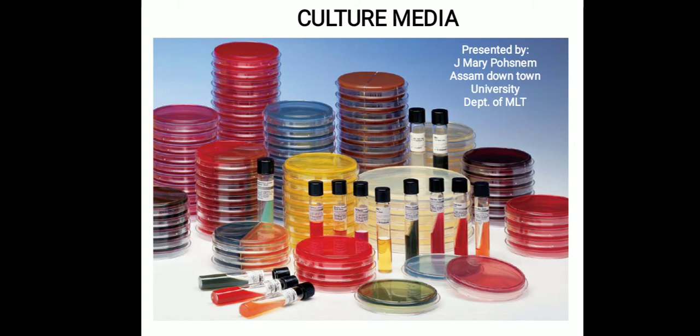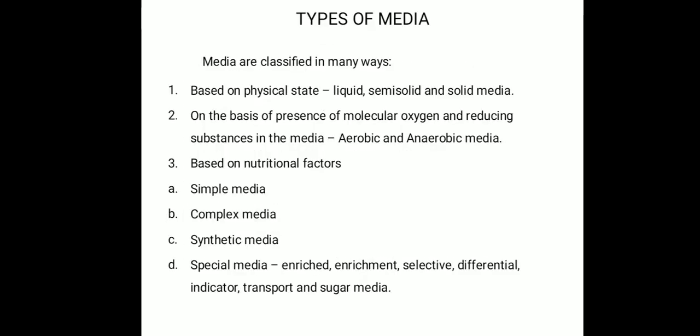Coming to the types of media, we have different types based on different requirements. Media are classified based on physical state like liquid, semi-solid and solid media, and based on the presence or absence of molecular oxygen and reducing substances in the media, like aerobic and anaerobic media.